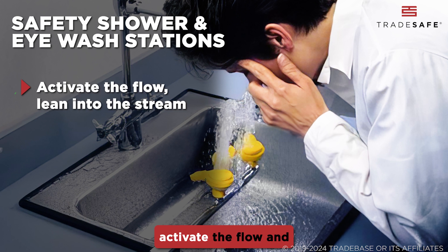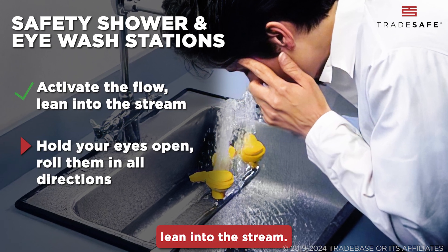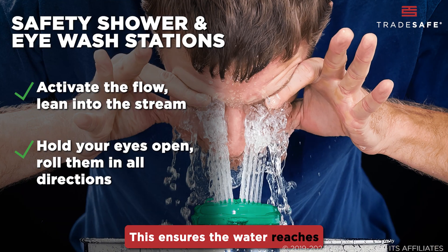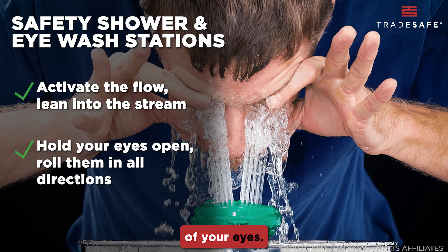For eyewash stations, activate the flow and lean into the stream. Hold your eyes open and roll them in all directions. This ensures the water reaches and flushes all parts of your eyes.